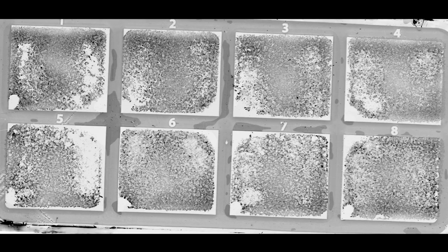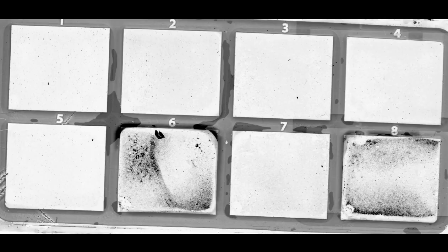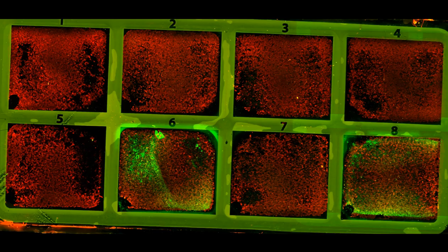This is one channel. And here's the second channel. I think this was the channel of protein of interest, GFP. And now I would like to show you the overlay of both channels. What you can see here nicely, the red signal, this is the autofluorescence of your cells. And overlaid here the green signal, this is the GFP signal, which you can see in well number 6 and number 8.